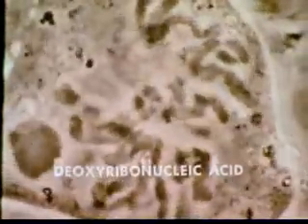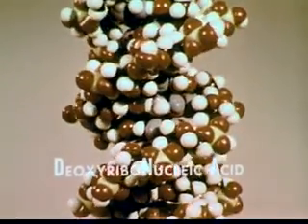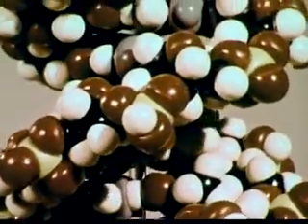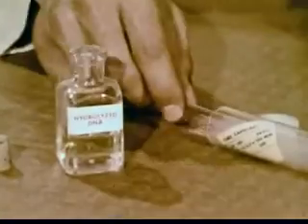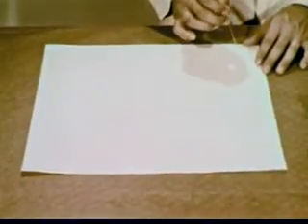The biochemist has learned to collect chromosomal material from cells and has found that it is composed of deoxyribonucleic acid, or DNA. Because DNA is a large, complex molecule, it is helpful to break it into its component parts and identify them. These component parts can be separated from each other by the technique of paper chromatography. After treatment with an acid, a small drop of the chromosomal material is placed on this large piece of filter paper.